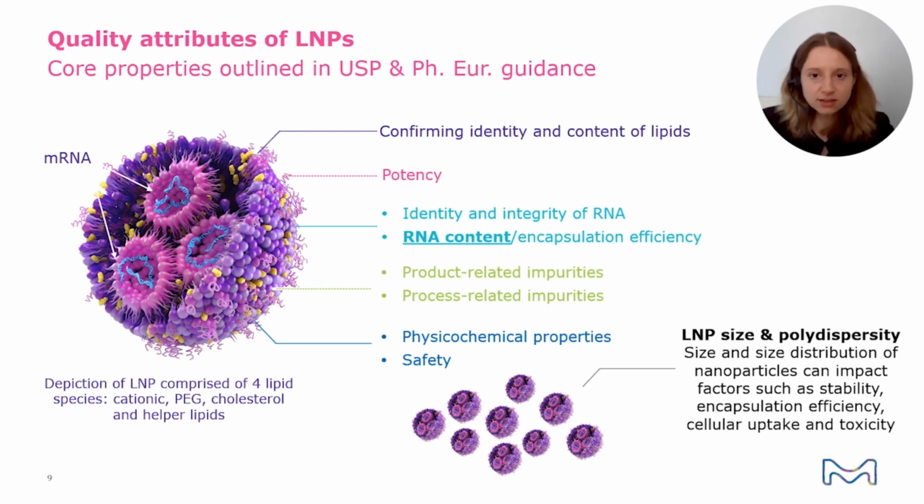The second very important critical quality attribute is the RNA content, because the RNA content within a LNP formulation is actually the value that is also then later needed to precisely dose the RNA-based medication. So therefore, you need reliable assays to quantify the RNA content within the LNP formulation.